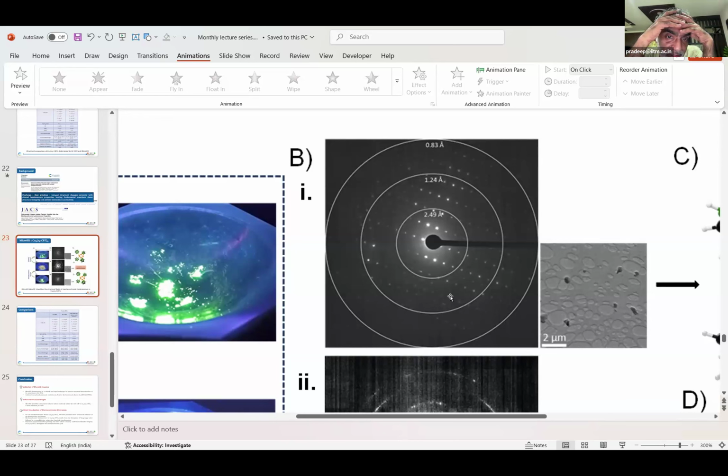In a particular crystal, a certain number of electrons are there in a lattice plane because of the atoms that are present. If you have a few atoms or clusters less in that lattice plane, the intensity may be less. I do not know the correlation between these oscillating intensities along a particular Miller index. On the left side, there are two bright spots and no other bright spots. Some clarity is required here because these things will become important in the context of your later work or life.